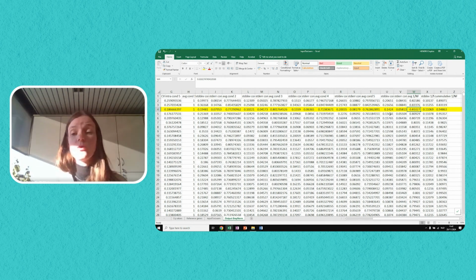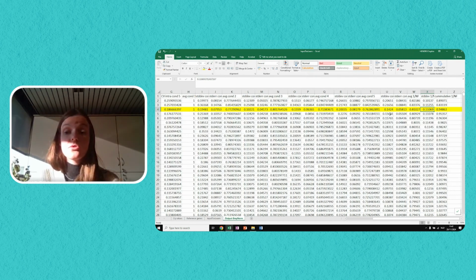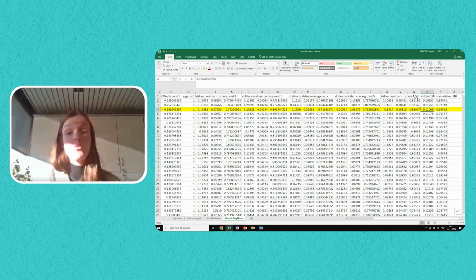So that's also something that ideally should be close to 1, because this would mean that the normalization would not have a strong impact on the obtained data. And then here it will also give the standard deviation for these values. So how much difference is there between the individual 1 over NF values. And it will also calculate a cumulative deviation from 1. So ideally, this is also as low as possible.